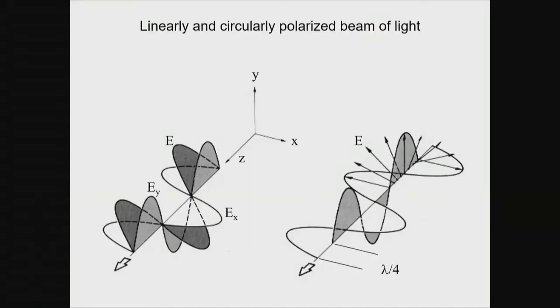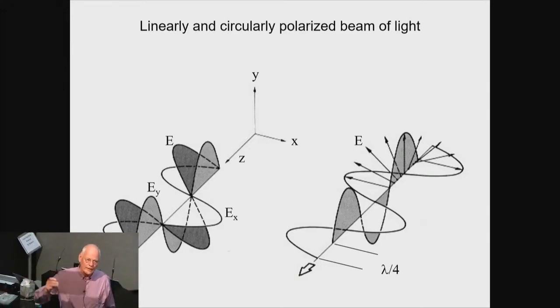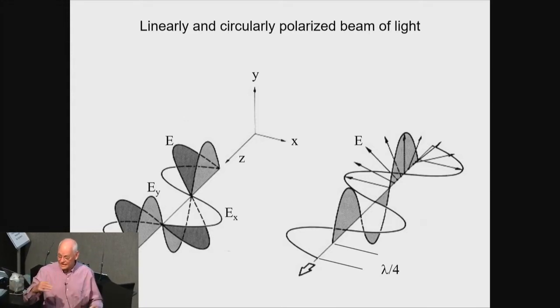If you have, for example, linearly polarized light, you can generate it through these kinds of filters. Regular light that comes from an incandescent bulb, a fluorescent bulb, or the sun is typically not polarized because it has the statistical property of having all kinds of polarizations mixed together.